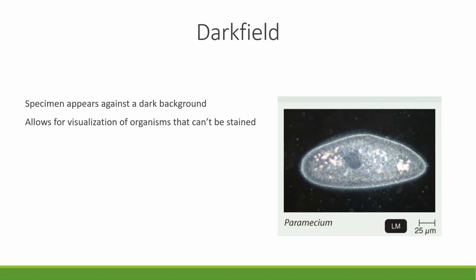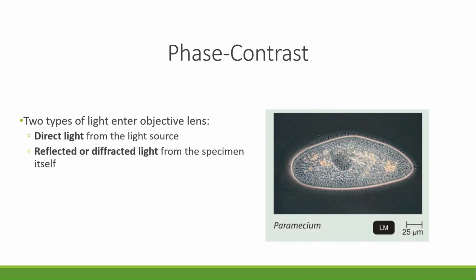Something really beautiful about dark field microscopy is that we can see the different parts of what is called the ultrastructure of the cell, or the inner parts of this cell. So there are some organelles and things we are able to see inside of the cell that we weren't able to see with that bright field microscopy image.